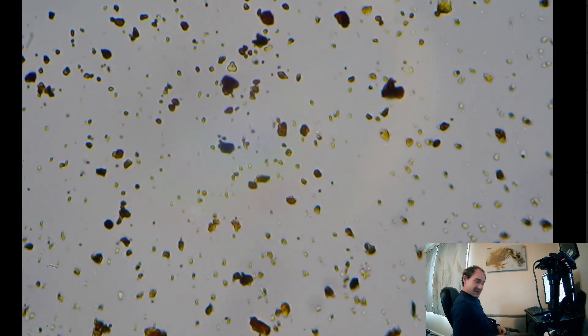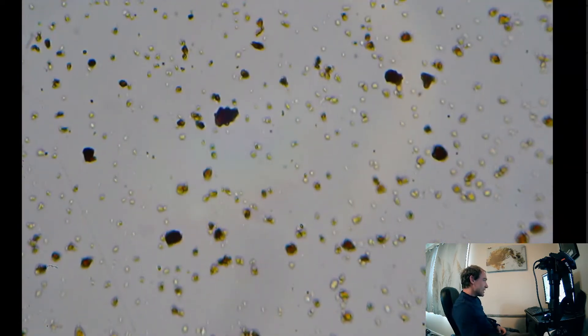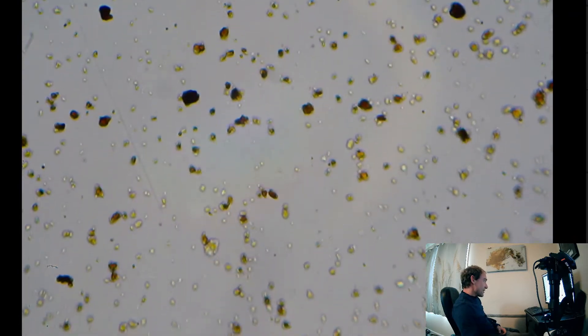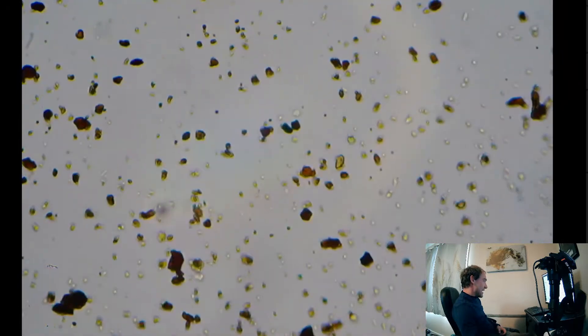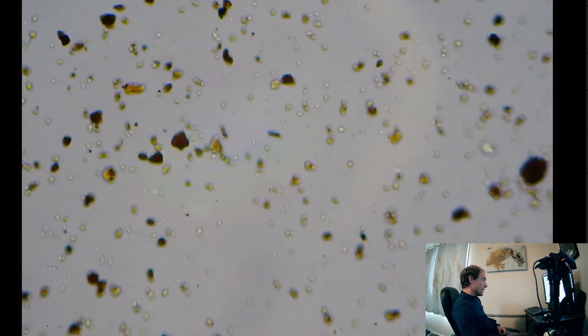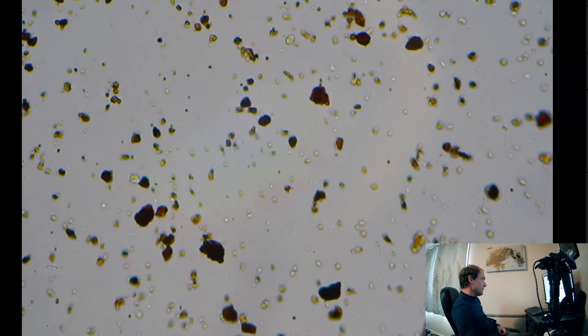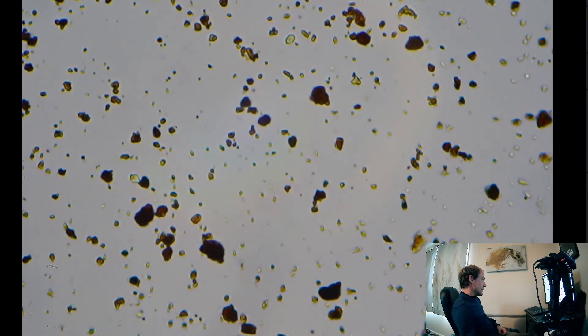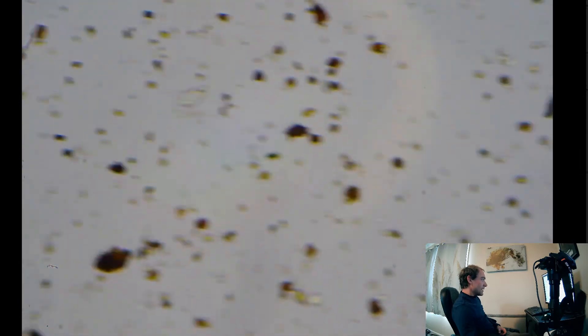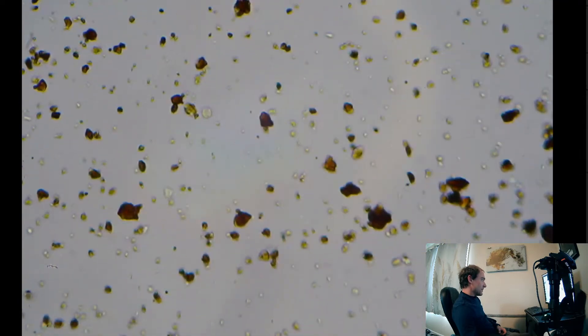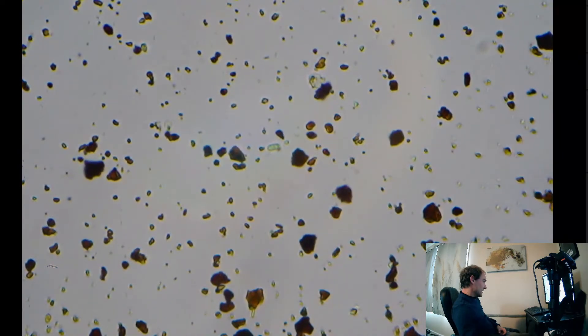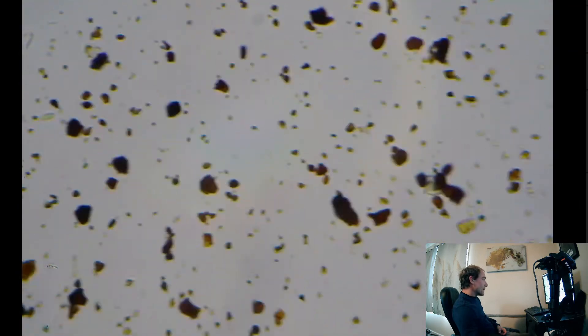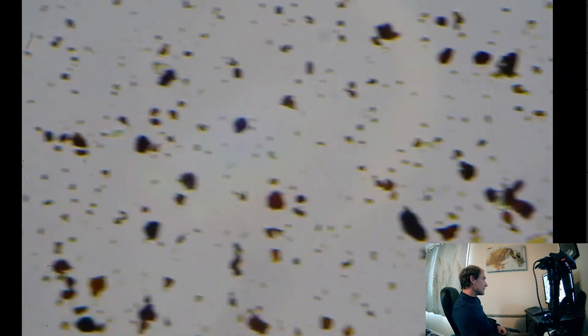Yeah, this is definitely the most requested thing for me to scope out, so I definitely wanted to check it out for you. I heard great things, so super excited to see how the plants react. Just watered it on some of them this morning and actually put a drop into the water that I soaked some tomatoes and some peppers, just for an hour, and then put them in the soil. Getting those started.